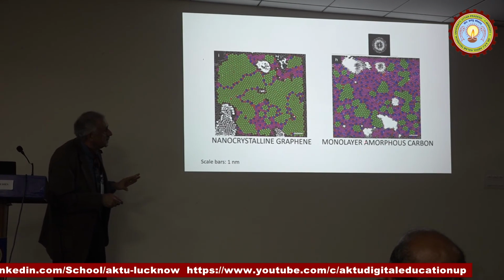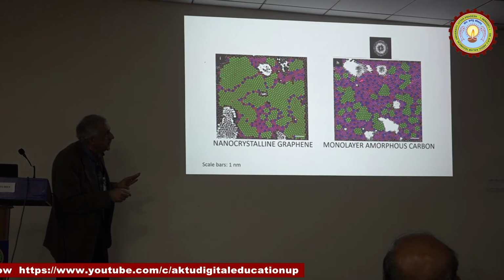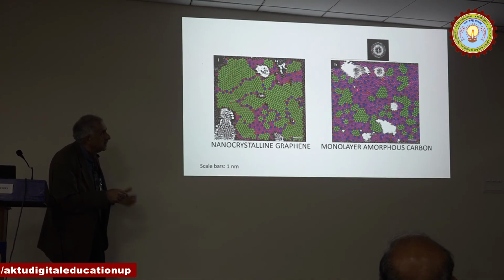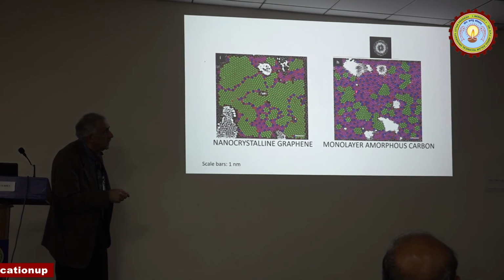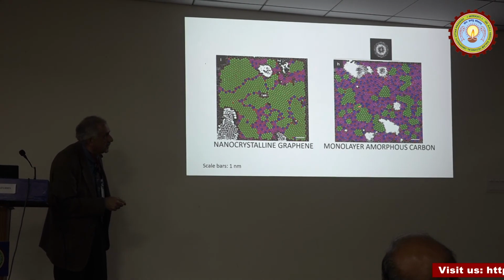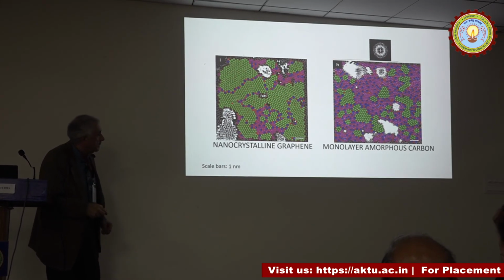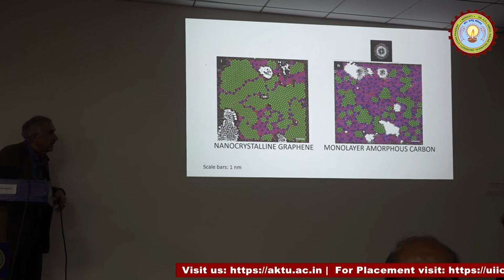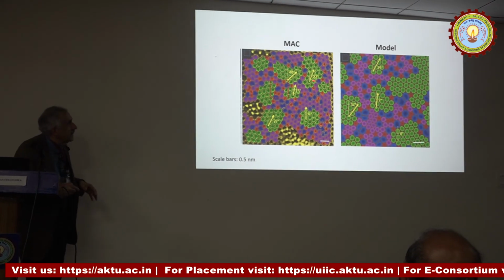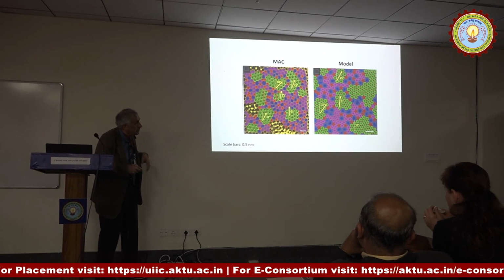This is Barbaros's monolayer amorphous carbon, and you can see that this is really and truly atomic scale imaging, and we colorized it to see that this is a continuous random network going all over the place, and there are no unambiguous microcrystallites, or nanocrystallites in this case, in there. And this paper was accepted by Nature. It was published just a few weeks ago, right? And here is a model of the nanocrystallites with the arrows pointing in different directions, which is important.